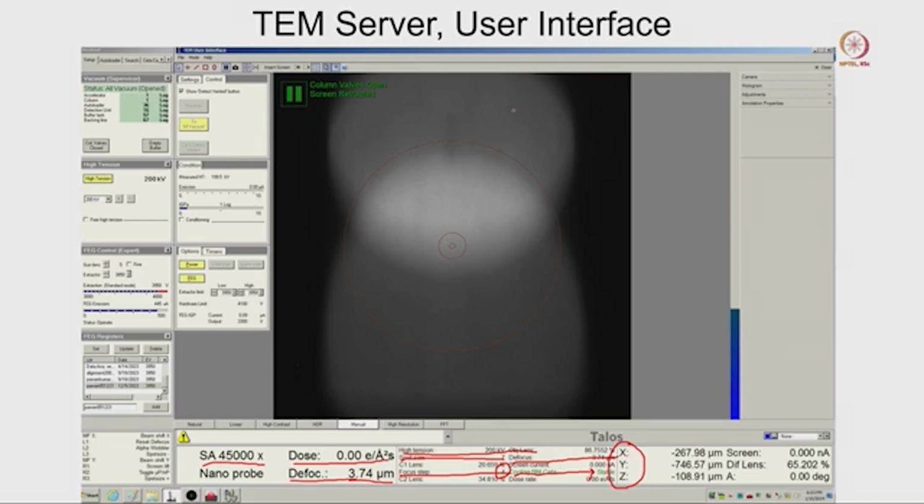Consider this is your entire area where you want to image, and you can move around in any direction. If this is your sample area and this is the trajectory of how you are moving, this movement may be the x and y direction movement. I will show you in the next slide how this looks.